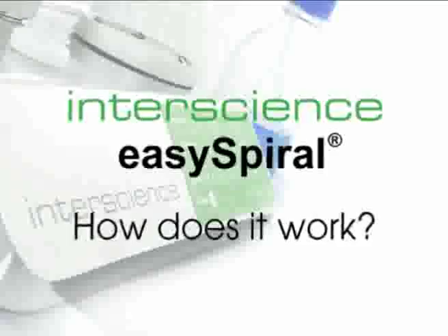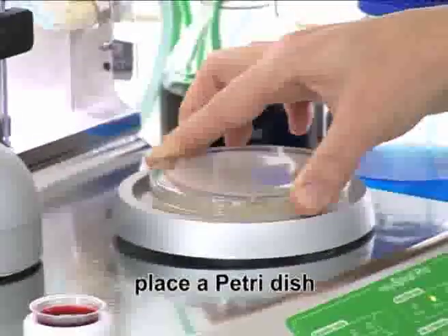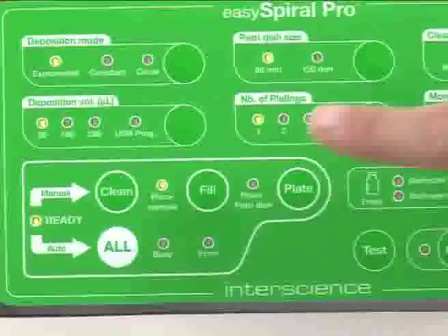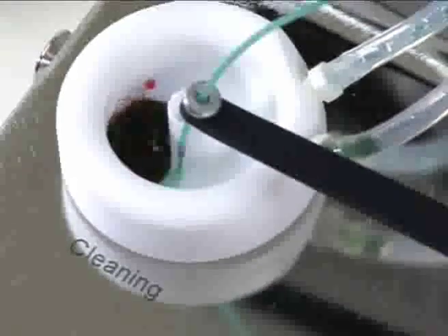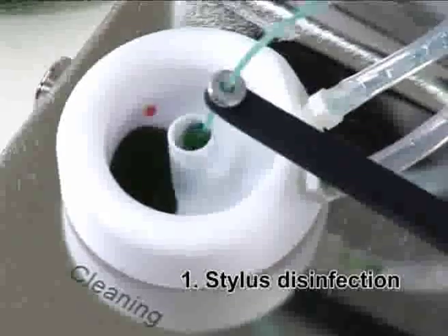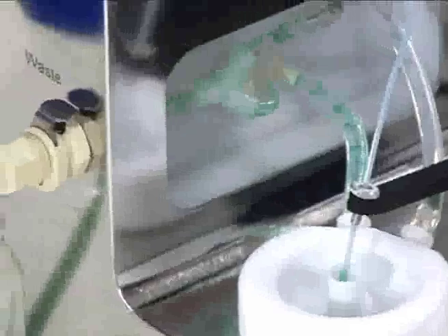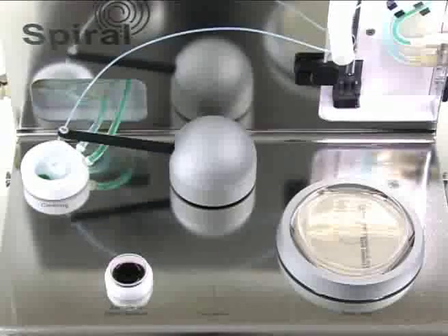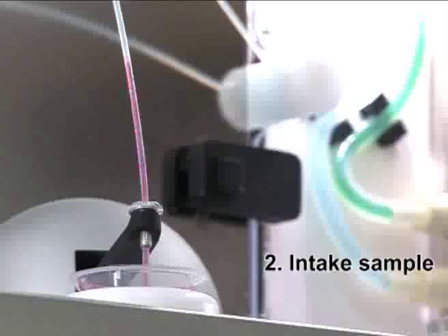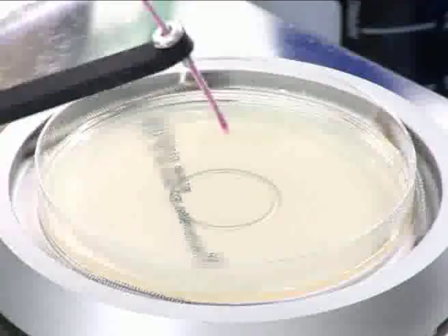Using a spiral plater has never been more simple. With the easySpiral, place a petri dish and press one button to start the fully automatic cycle. The plating cycle includes the stylus automatic disinfection, the sample intake, and the sample plating.